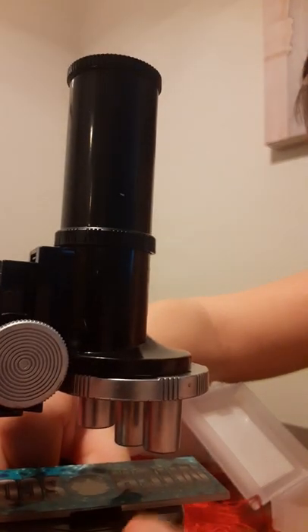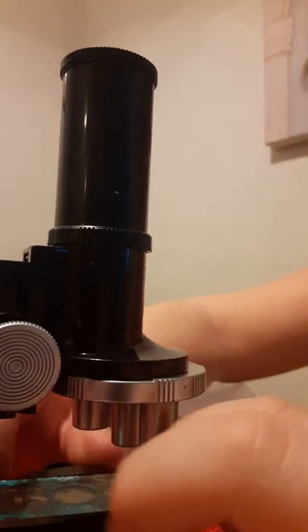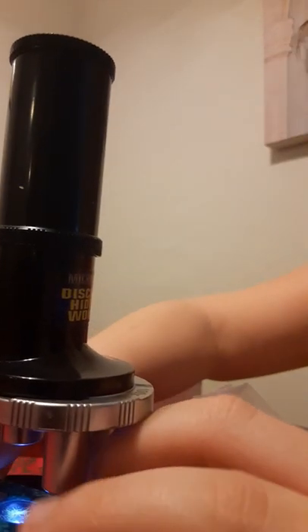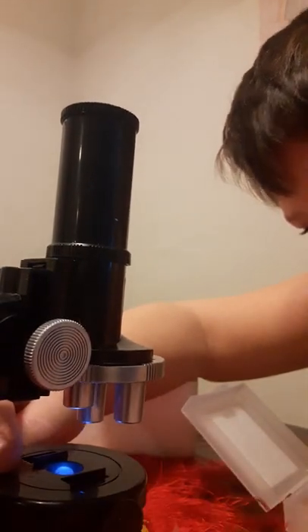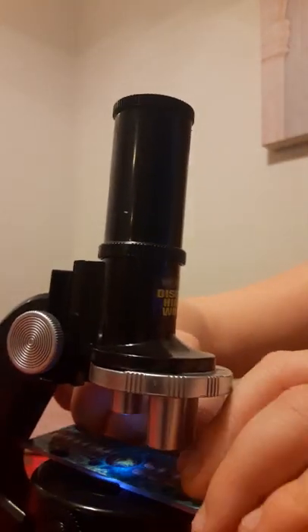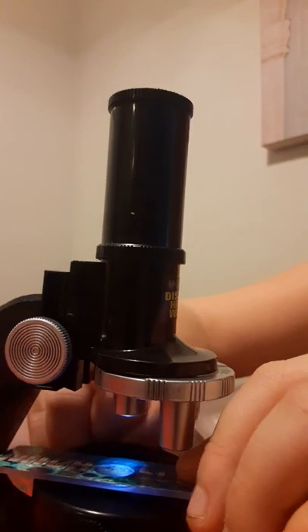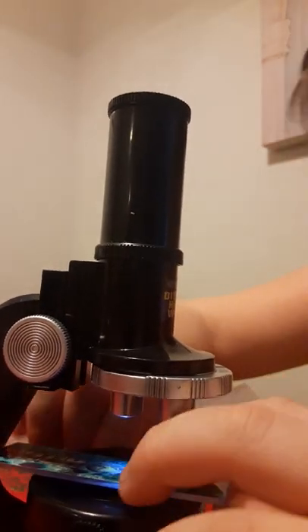Basically you can adjust this however you want. I wouldn't recommend doing that to mess up your push. I leave it back because it is spring-loaded, and now sometimes it flings out and that's okay. Basically you want to turn your light on, and then it keeps flinging out. It's kind of hard to operate, not really good.